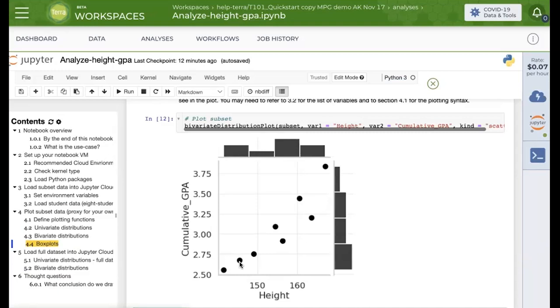Does anyone have any questions about that? Please feel free to post in the chat, or need me to show anything that Anton was demonstrating. Liz, I was wondering if there are certain public workspaces that are more vetted or good places to start. Like if you were going to start with RNA-seq or something straightforward, do you have any advice for choosing a workspace? I do.